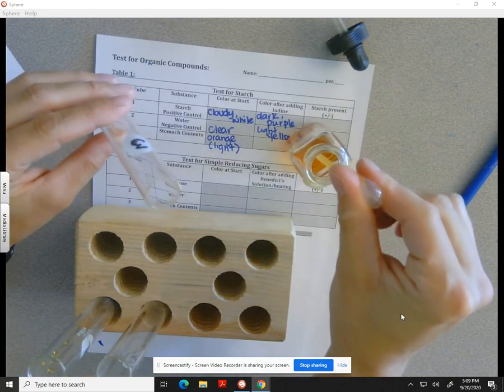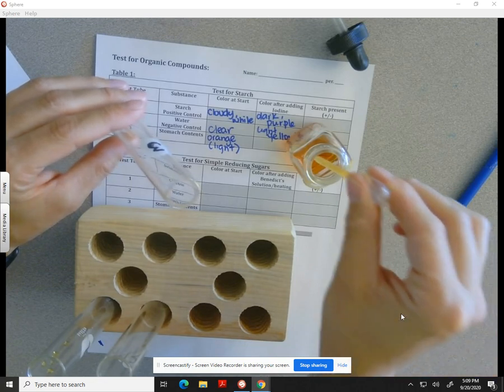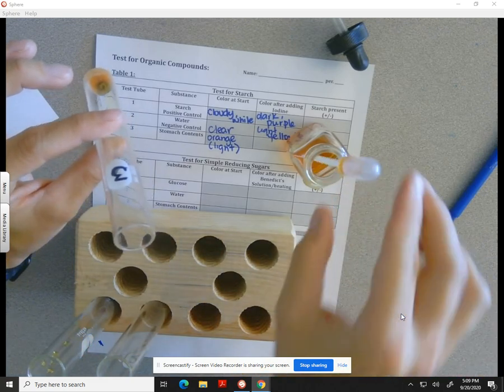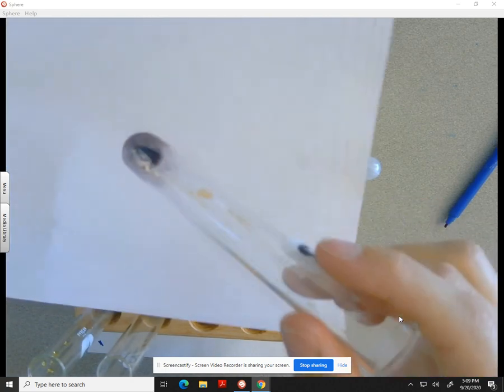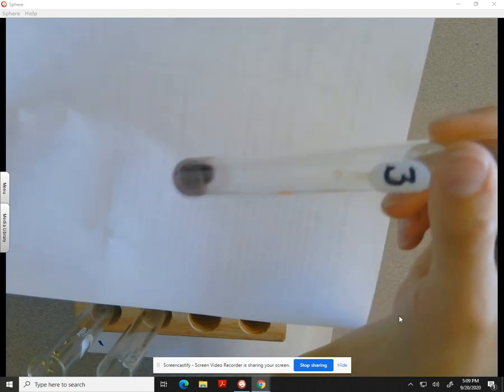I've got my iodine here. Okay, and I'm going to suck up a bunch of iodine here, and I'm going to add 3 drops to this test tube. Here we go. 1, 2, and 3. And I'm going to take that and swirl it all around. I'm going to put this against a white backdrop so it's easier to see. And I would say that's a pretty strong reaction there.